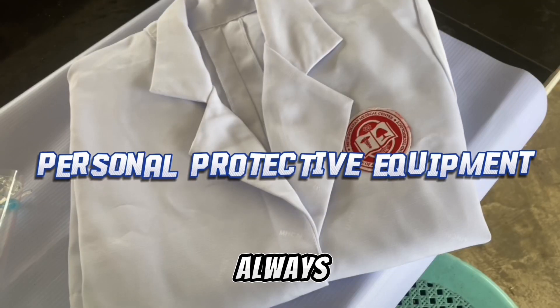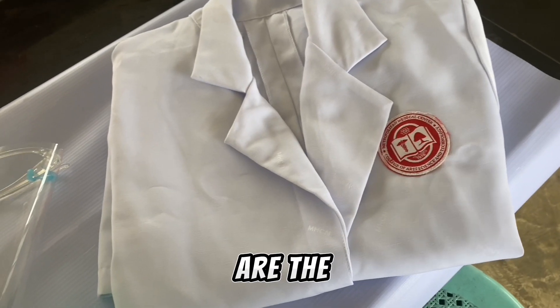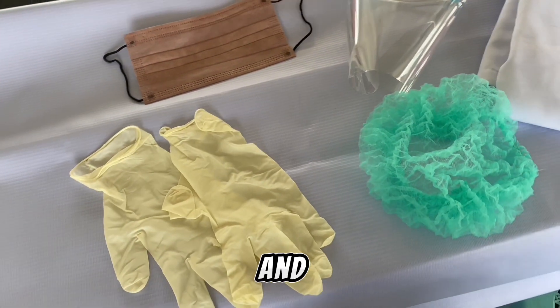Before we start, we must always take note of the personal protective equipment, which are the lab gown, hair net, gloves, face shield, and a mask.